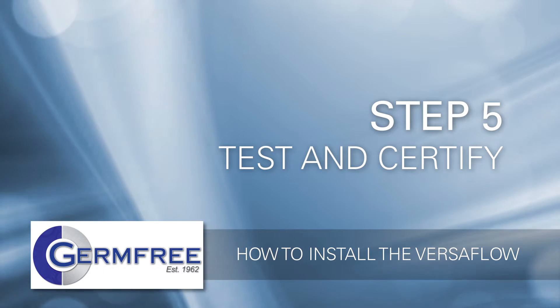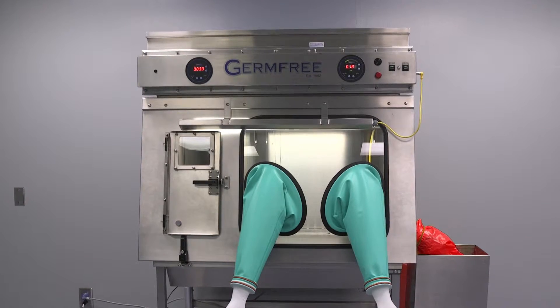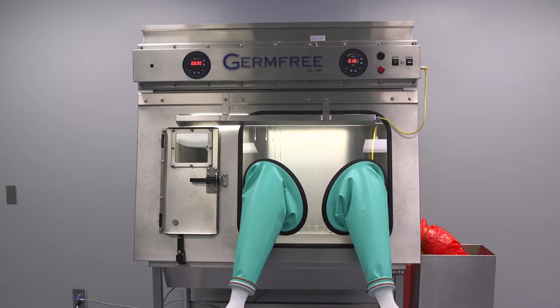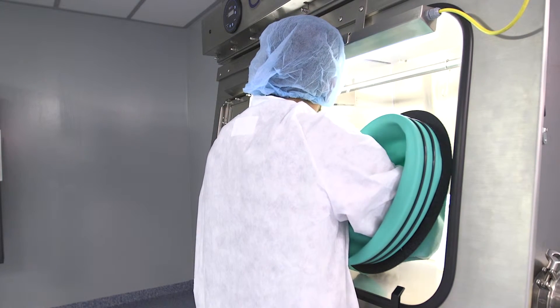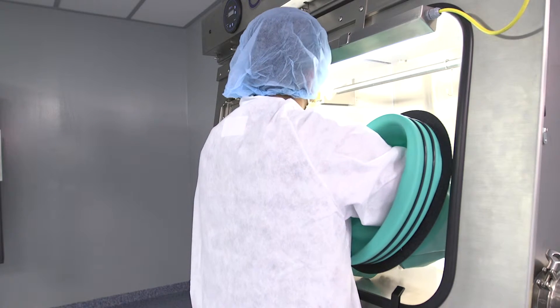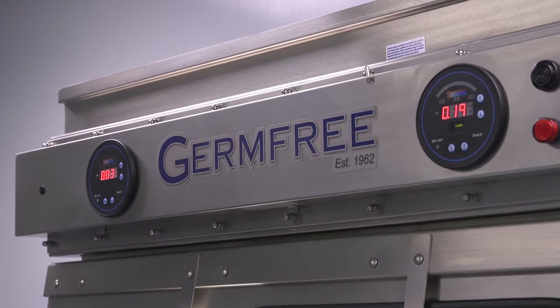Step 5: Test and certify the Versaflow. Every Versaflow is tested before leaving GermFree's factory for proper function and performance, but on-site certification must be completed before using the Versaflow for making patient preparations. Before operating your Versaflow, the HEPA filters, air flows, and pressures should be tested to confirm that the unit was not damaged in transit and has been properly installed.